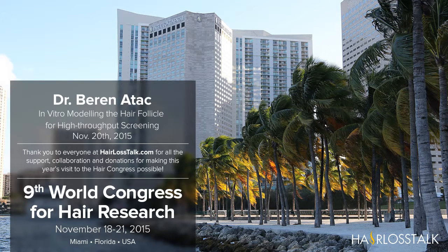Of course, my first question was, can I get the same response in dynamic culture? Will they polarize? Will they form sheets as well, like I saw before? And yes, and we can actually culture them up to 21 days. At this point, we also wanted to see the markers they are expressing. They express nice laminin 5 in the basement membrane and collagen 4 inside the DP region, as well as endothelial cell markers, melanocyte markers, and again an organized inner and outer root sheath structure with another differentiation marker, keratin 25.